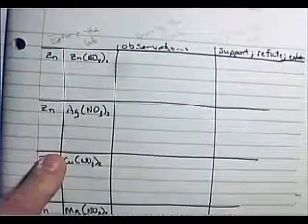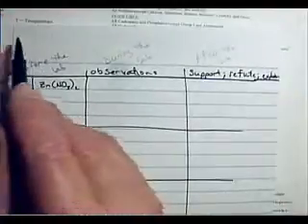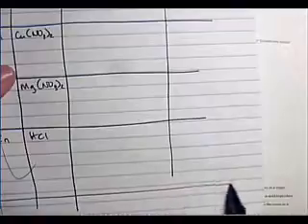All right, now you don't need these pencil marks up here. I'm just telling you what we're using those for, okay? What you do need at the top of this page, though, is the title for the lab, a page number in the upper right, and a date in the upper left. Always leave room at the bottom for people in your lab group to sign and date your work to show that they were witnesses to the fact that you did this in a lab.